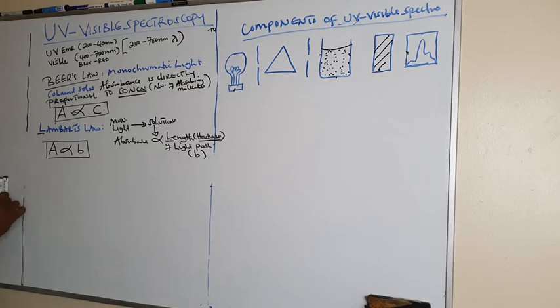So if we combine all of them, Beer-Lambert's law.